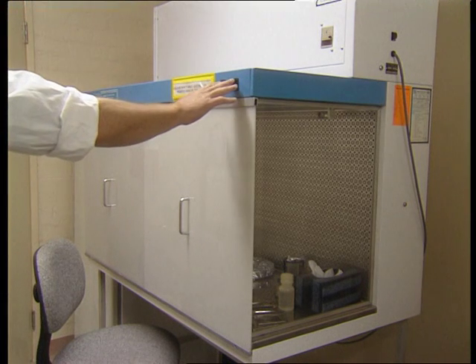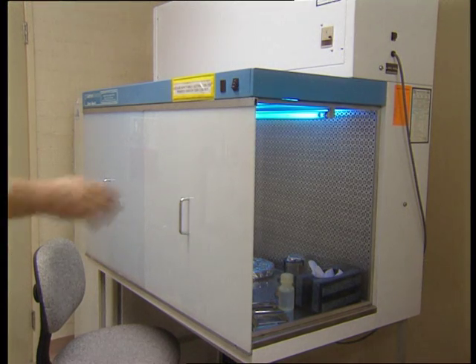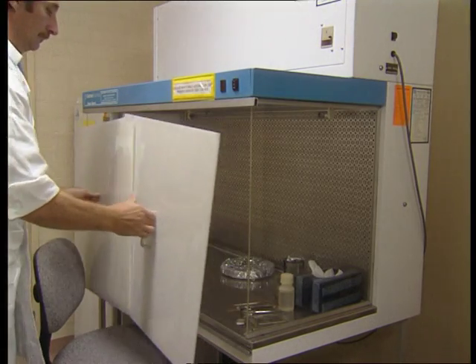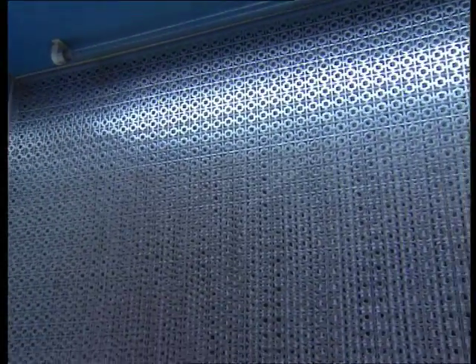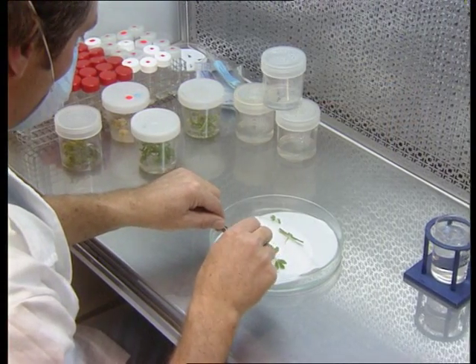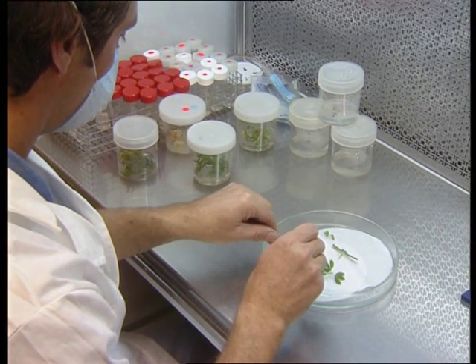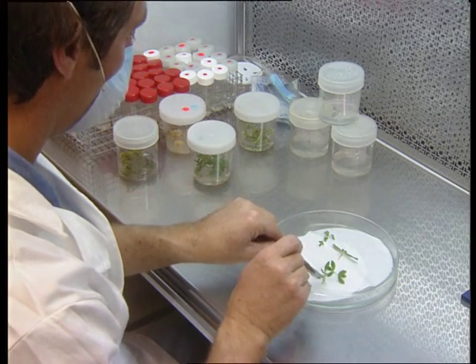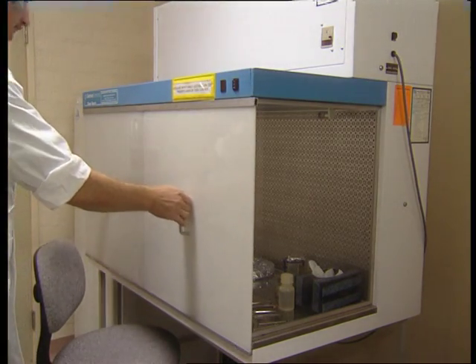The laminar flow cabinet or transfer hood is a cabinet in which air sucked from outside has passed through very fine filters called HEPA — that stands for High Efficiency Particulate Air. This filtering system ensures that the air flow over the working bench is completely sterile. In fact, the HEPA filter catches any particle which is bigger than 0.3 microns in diameter. Since there is a continuous air flow through the inoculation cabinet, it is practically impossible that anything can pass from the outside room into the cabinet itself. When the cabinet is not in use, it can be closed from outside air by use of plastic shields like this.